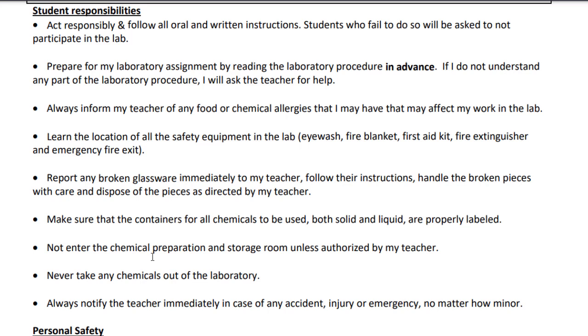You're going to see when you get into the building that we are attached to a storage room. You just can't go in there, and that's pretty simple instruction. Never take chemicals away from here.